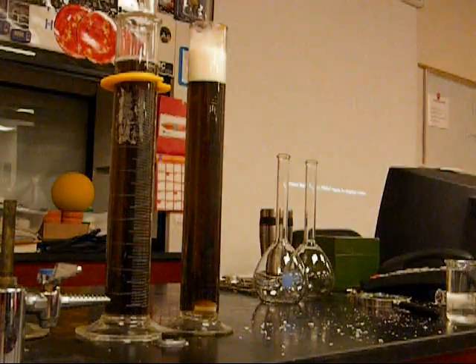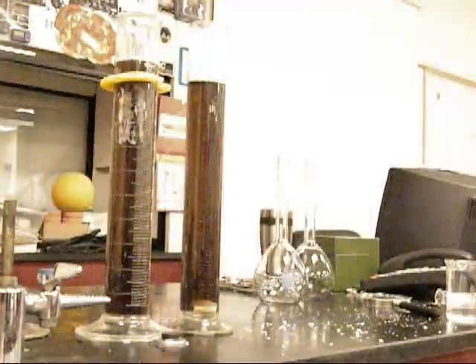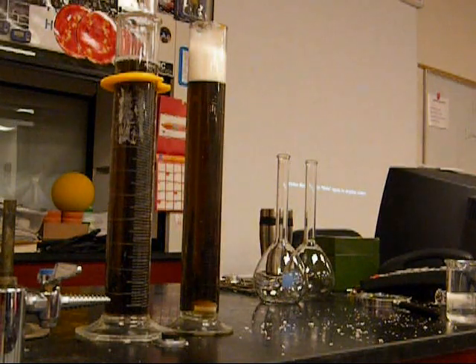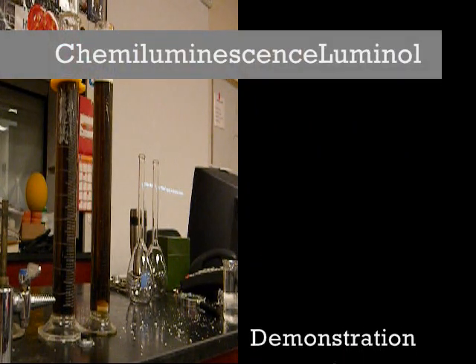You ready to be even more amazed? Lights coming on. Ew! That just looks gross. Anyway, lights on — blue glow. And the thing is, if I left the lights on, that's what it would have looked like. It would have gone through a color change and that's it. That's what you would see. You wouldn't notice the glow. Notice the glow is that thing.